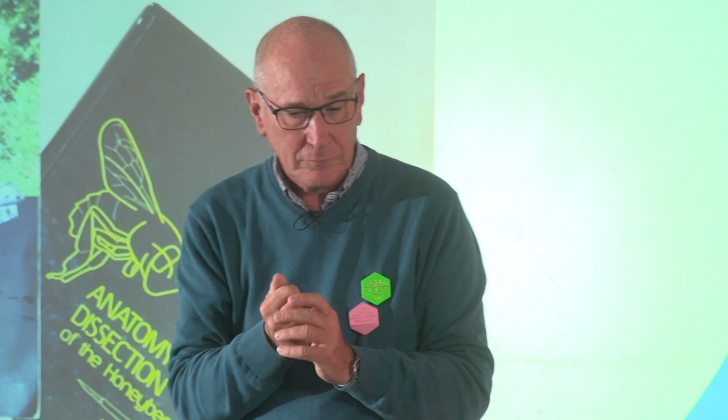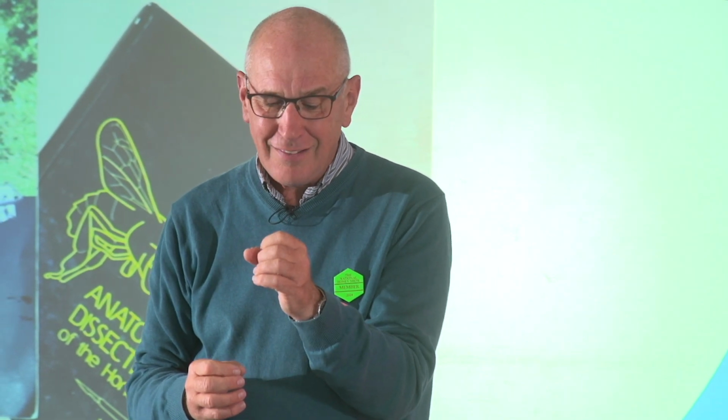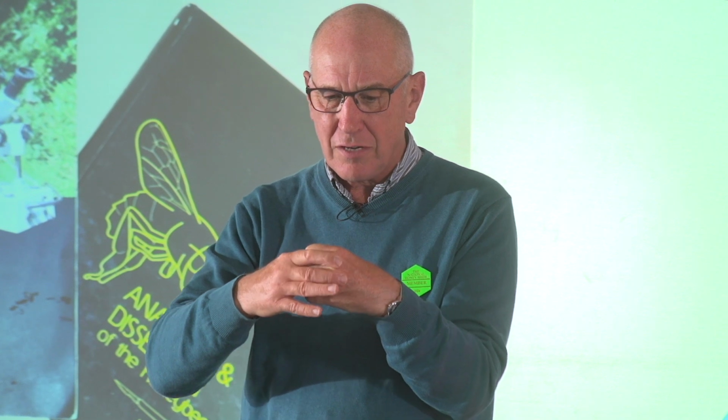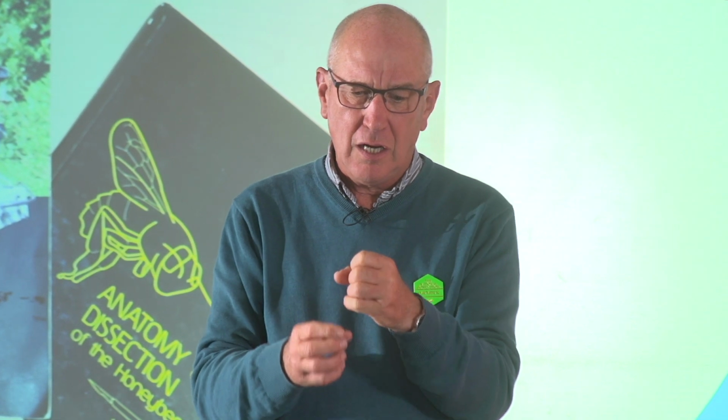That's the way. I was actually meaning the little sort of child's microscopes. Oh, the little ones. Yeah, that's right. Oh yeah, the little cameras. They are good. You can see a lot of detail, and they work with your laptop. Personally, I've struggled a lot with them, but that was in my early days. I gave up, because I couldn't get the focus on them.